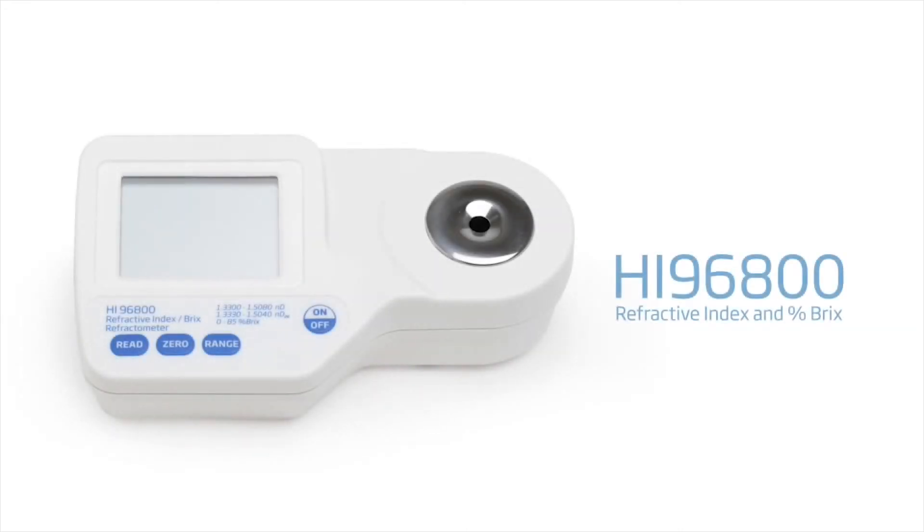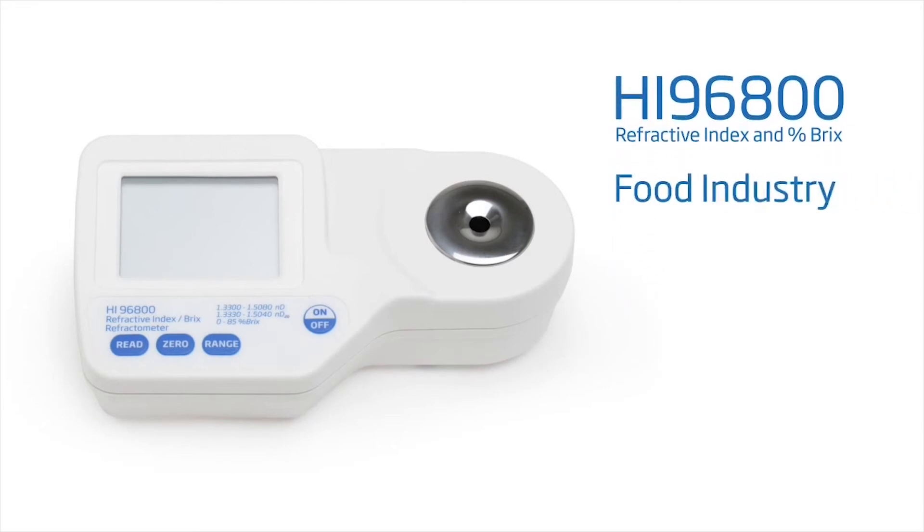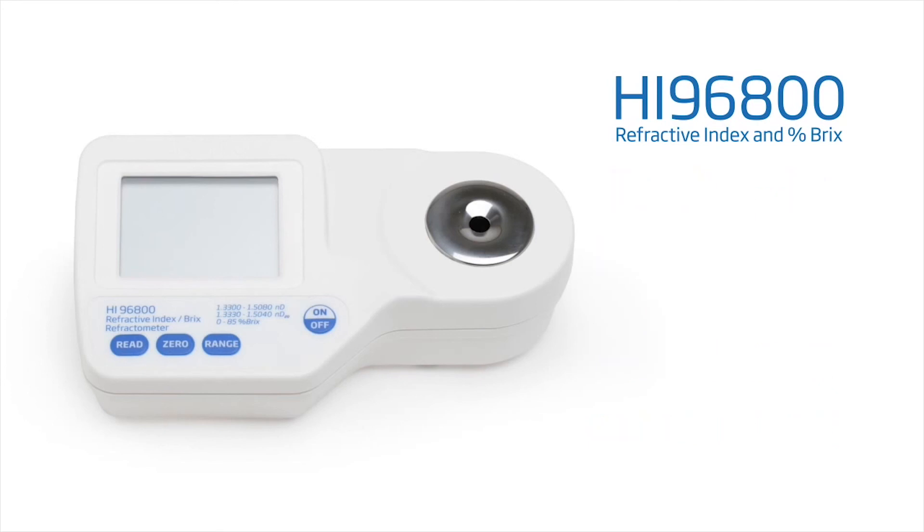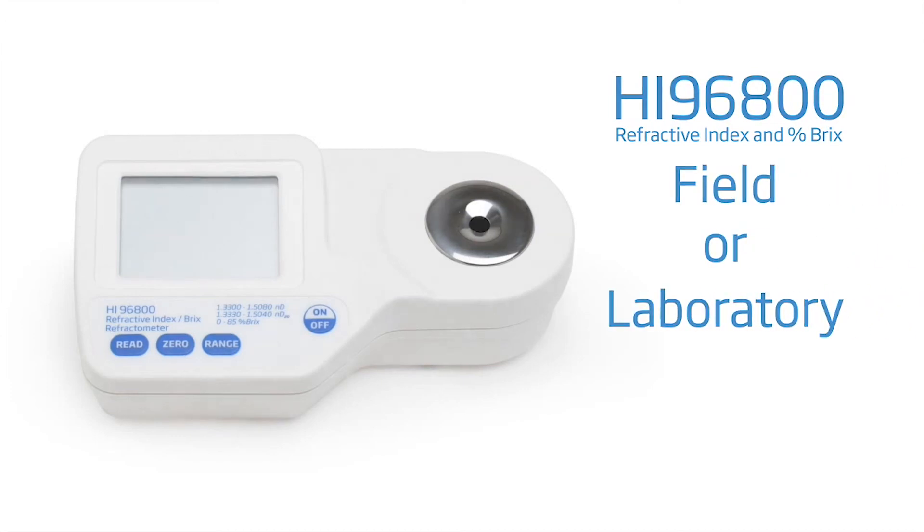Hanna's HI-96800 digital refractometer offers customers the ability to measure refractive index for a variety of samples found in the food industry, pharmaceuticals, chemical manufacturing, and many more. This meter offers high accuracy and durability, making it a great choice for field or laboratory use.